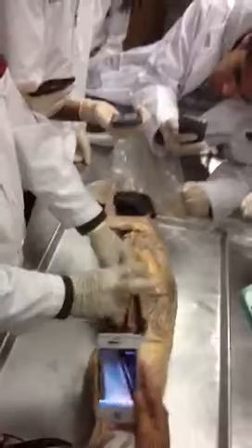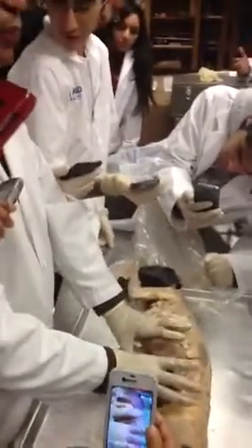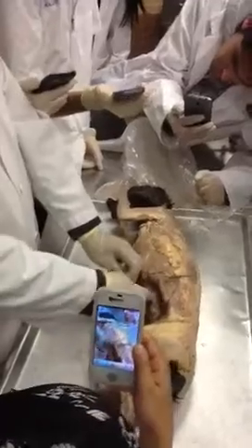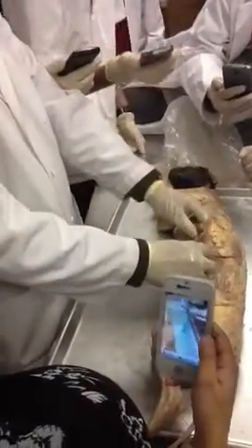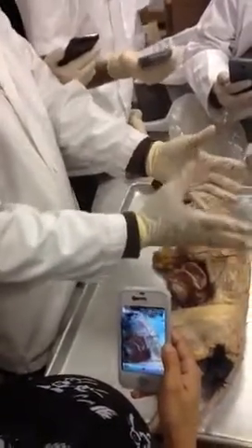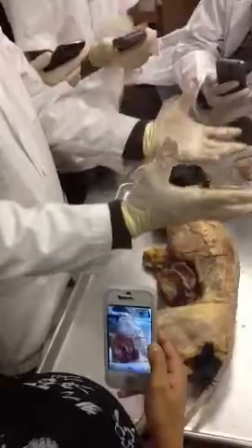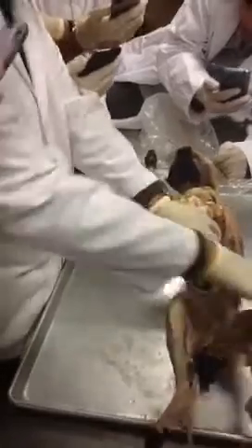So mesentery is serving two great jobs. Number one, holding the intestine in place, supporting it, and number two, allowing the blood vessels and other stuff to come and go from the intestine. So this is the connection of intestine from the posterior abdominal wall. Intestine is not something like in the middle of nowhere. It is connected. All right. So those of you who are wearing gloves, you can actually help me to show you something.